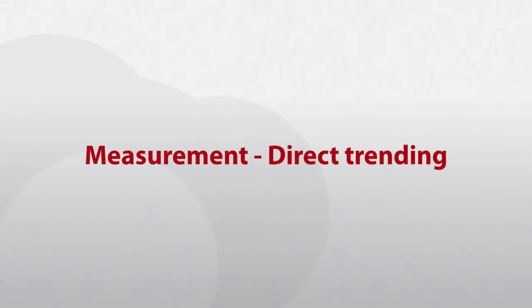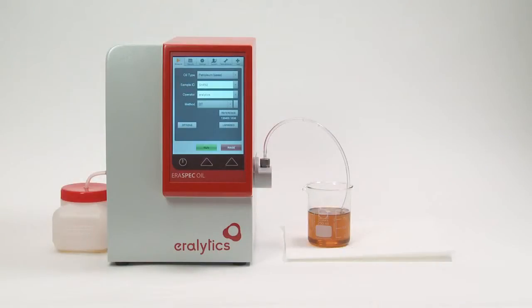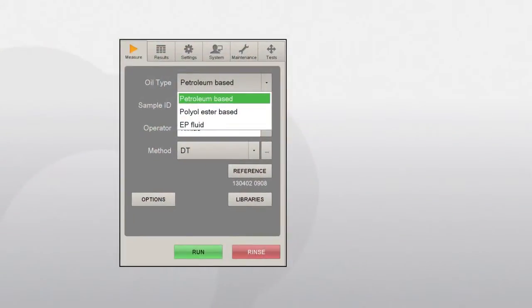Making a measurement. Direct trending. To make a measurement, oil type, sample ID, operator and method must be selected. Select the oil type for the oil that shall be analyzed. This will determine the standards that will be used for evaluation of the spectrum.